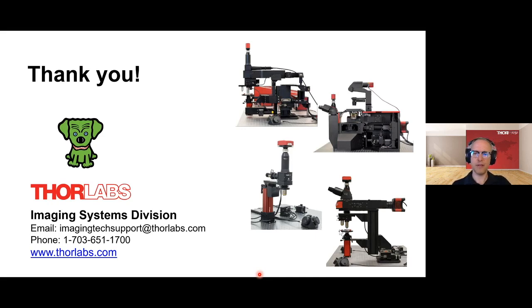All right, going to the second one. Can you correct aberrations using the electronics? How does the DAC and digitizer contribute to the processing of the image? So you can correct some aberrations. If you have pincushion or barrel distortion from your scan engine, you could correct that at the image formation level.